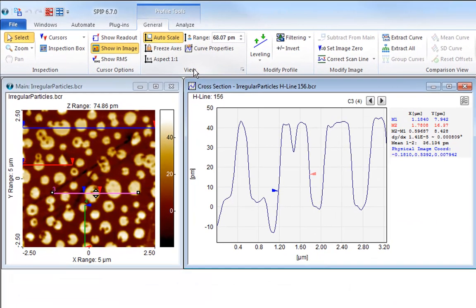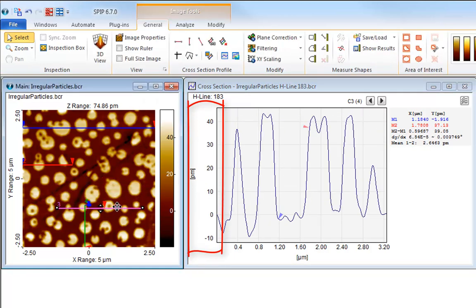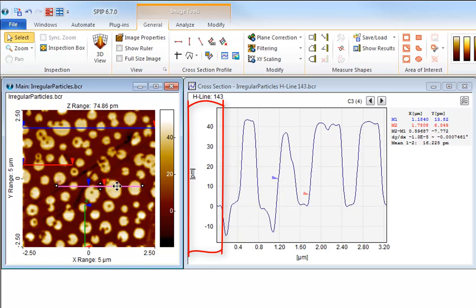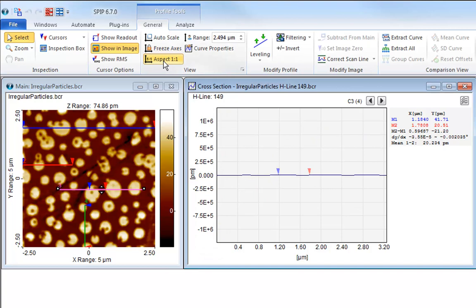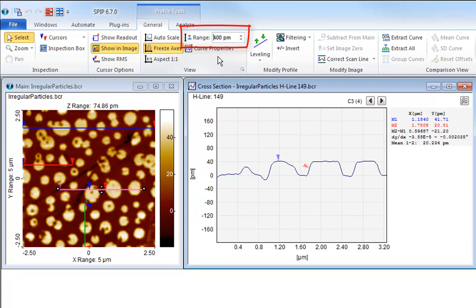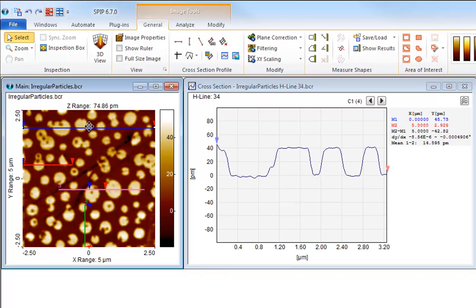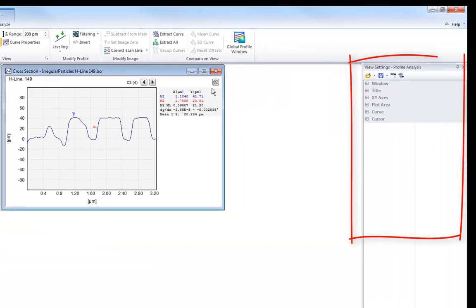Use the buttons in the view panel in the ribbon to quickly adjust the Y-axis scaling. Auto-scale will continuously adapt the Y-axis scale according to the profile data. Freeze-axis will fix the scale at the current value. 1 to 1 will give you a view where the X and Y-axis magnifications are the same. In this field, you can scroll through a range of nice values — a fast way of setting the Y-axis length to a nice round figure.